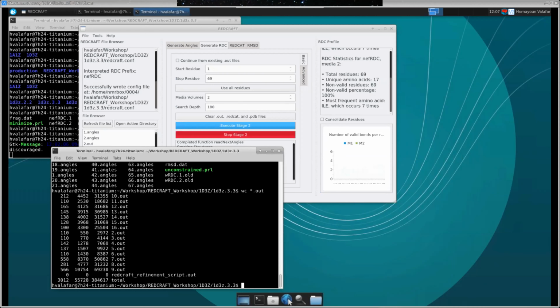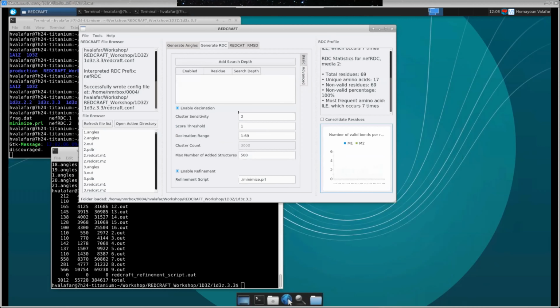So in this particular case, 566 minus 110, so that's 450-ish structures. Right. Yeah. And the 450 structures are representative of clusters of structures, clusters after this 3 angstrom clustering. Okay, so like that, 500 clusters you analyze outside of this 110 depth, from which you are able to derive 456 best ones.